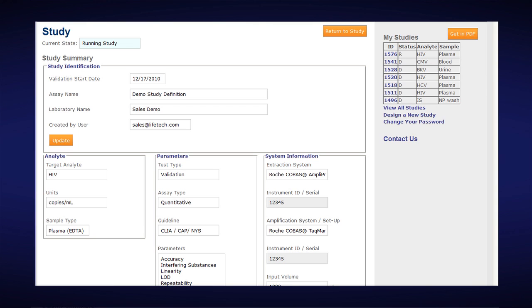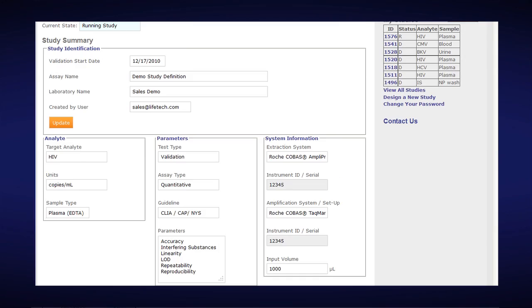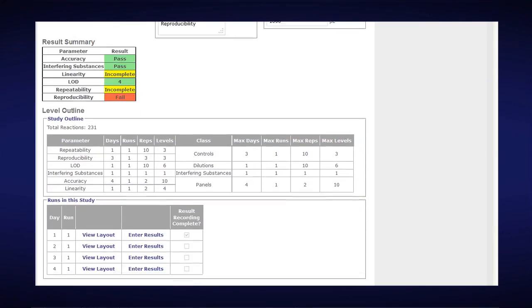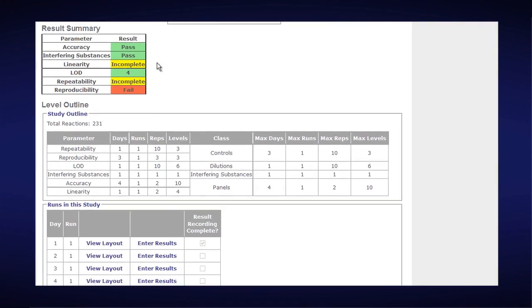Since I'm still running the study, I will be entering and uploading data. But if I'm curious and want to look at what the validation report looks like even though the study is not completed, I can scroll down and see where my results are at present state. The Easy Validation Tool has automatically flagged studies. We passed Accuracy and Interfering Substances. Linearity is incomplete. LOD has already passed. Repeatability is incomplete. And Reproducibility failed because there isn't enough data at this point.